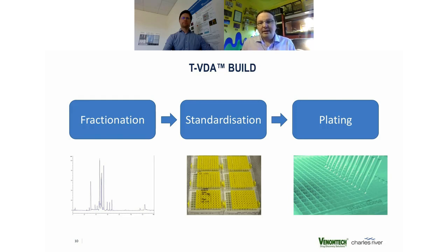Everything at the stock level is done in 96 well tubes with 2D barcodes on the bottom, and then reformatted into 384 for the plating at the end. These are in Echo compatible plates, although Echo dispensing was not used for this particular assay. It's a standard SBS format 384 well plate, lyophilized and heat sealed, which means they can be shipped at ambient temperatures anywhere around the world. For this particular project, it didn't need to go that far, just up to Cambridge and Juha and the team, which is where I will now hand over for the assay part of the talk.